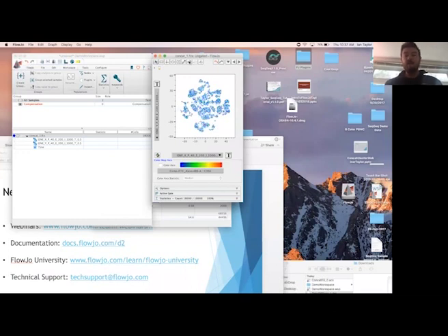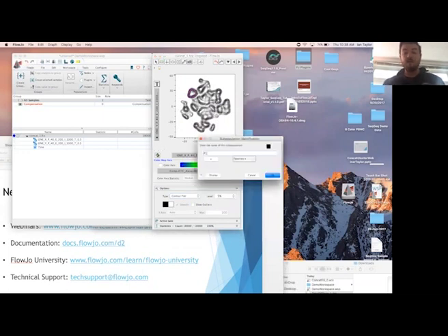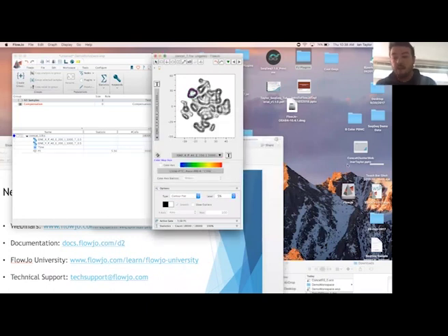And we could easily gate on those using the AutoGate tool. Now, I particularly like the AutoGate tool because it is so unbiased. It's just going to gate based on the density of a certain area. So like I say, the contour lines is what it's actually using. And if we look at a contour plot, that should be really clear. So here's our different contour lines, and we can see if we're pulling out this island, it's going to stick to the contour lines. So let's just call this P1 because we don't know what it is at this moment. We can always rename it if we decide that this is something of interest.